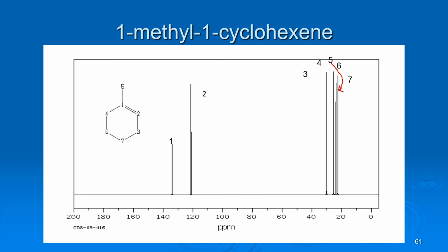So we're not going to do nearly as much with carbon NMR, but it's helpful to be able to identify the number of different carbons that you have and approximately where you might find them.